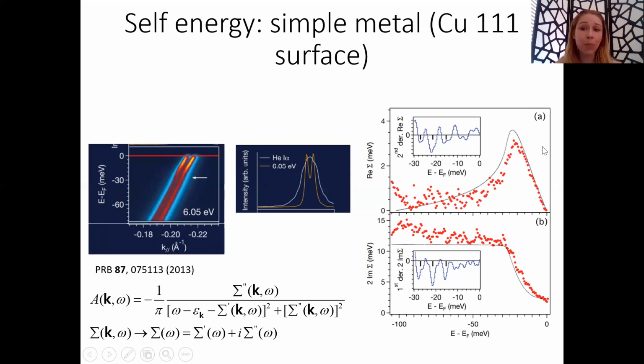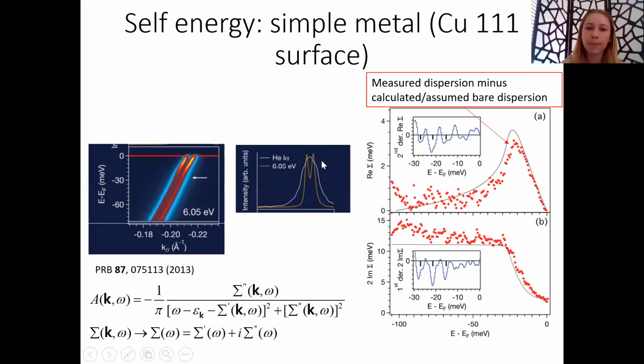So this is an example of how ARPES, although it's a technique that ostensibly measures electrons, can get information about behavior in the lattice as well if the lattice excitations couple strongly to electrons. So in this case, there is a phonon mode that couples strongly to electrons and causes sort of a bend or a kink in the band dispersion that is readily visualized with ARPES.